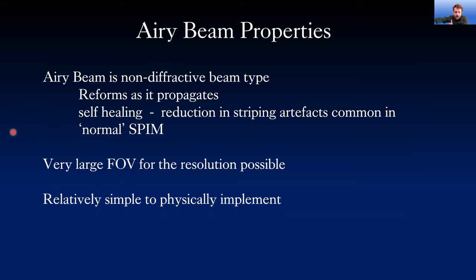And compared to the other types of beam, you get a relatively large field of view for the resolution that's possible. It's also relatively simple to physically implement, which is not a small consideration. While it's tricky to design, the implementation is just a simple optical element.